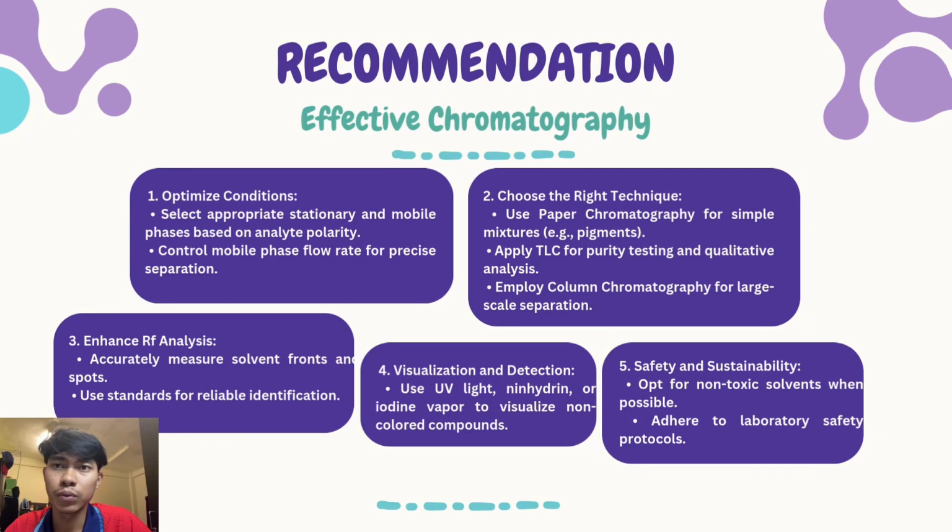Paper chromatography works well for simple mixtures such as pigments. TLC is suitable for purity testing and qualitative analysis. Column chromatography is recommended for large scale separation. The third point is enhanced Rf analysis. Accurately measuring solvent fronts and spots ensures more reliable identification, and using standards helps maintain consistency.